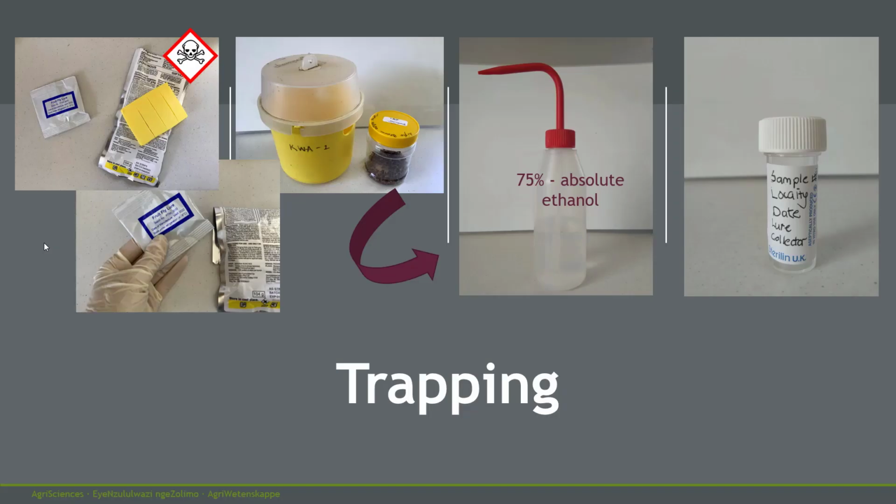the STDF. Trained technicians in charge of fruit fly monitoring will empty trap contents in the field and transfer them to a suitable container. Remember to wear rubber gloves when handling lures and toxins such as Vapona strips. This is important if you are using different lures. You do not want to cross-contaminate the traps. Also use gloves to handle the traps. If you get any of the lure on the outside of the trap, the flies may not go in.